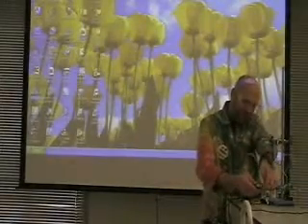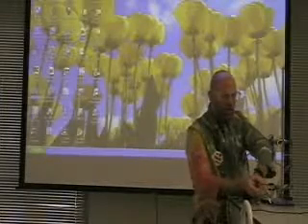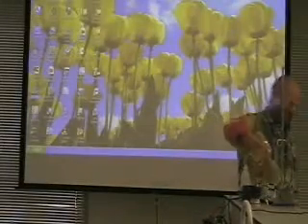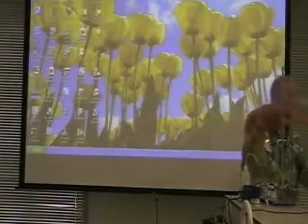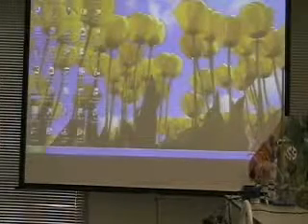Temperature and pH. Now, obviously, if you were going to do what's called a thermometric titration or a thermometric reaction, you would have insulation around the thing and you would have a cap on it and all that kind of stuff. This is a completely open system, so it's not going to be very accurate. But that's okay. It's just a demonstration.